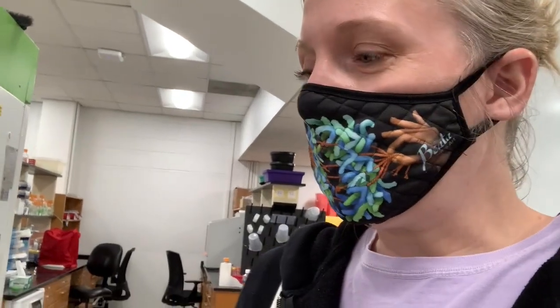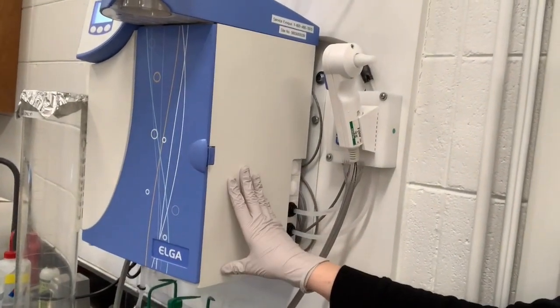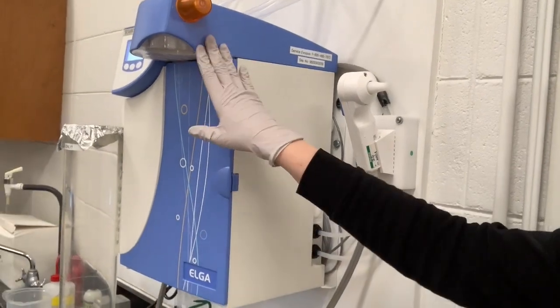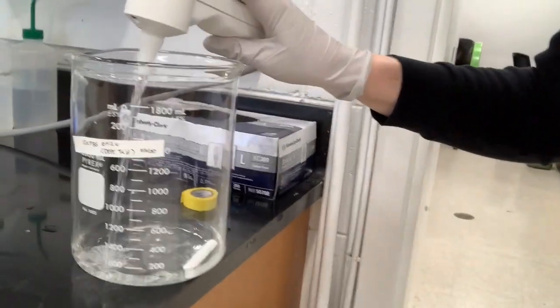All right, so when we're going to make a solution, usually the first thing we need to add is the water. And we have this machine in the lab. This is the ultra pure water dispensing machine, and it can dispense water out of this part of the container or this little handle, which is usually pretty convenient. And so the first thing I'm going to do is dispense water.